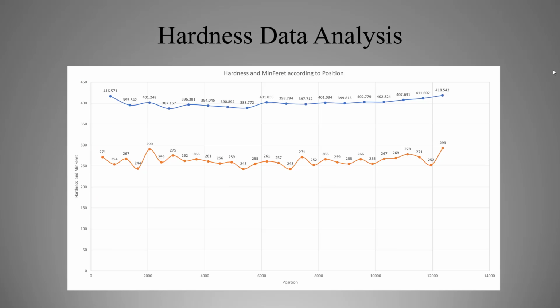I attempted to graph the hardness values and the thickness of the area of interest of the sample with respect to the global position of the images. And although it is not a clear-cut correlation, I did notice a similar trend in the two values. On the edges of the sample, where the coating is thicker, the hardness value is higher as compared to the mid portion, which is not as thickly cold sprayed.